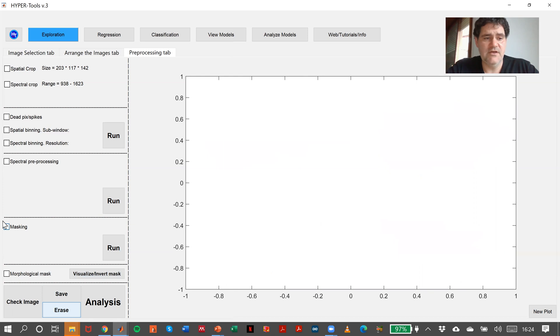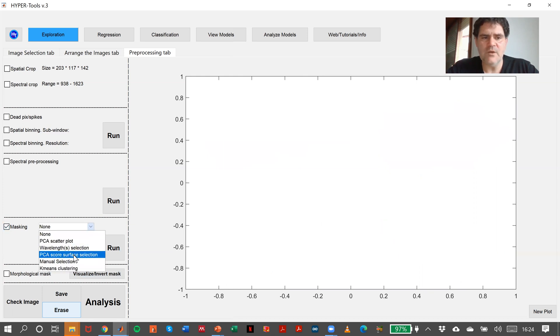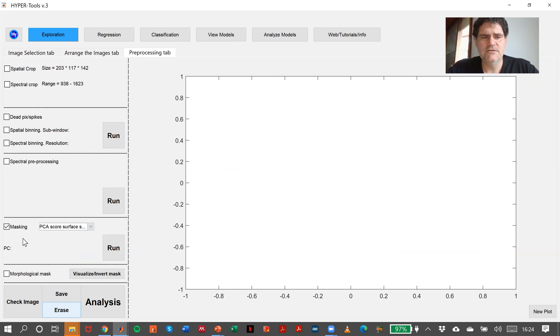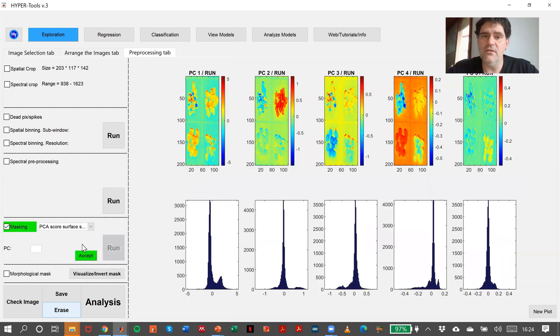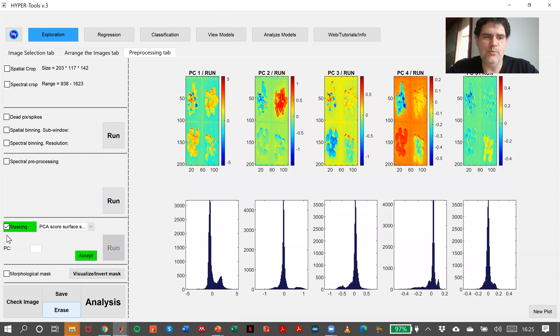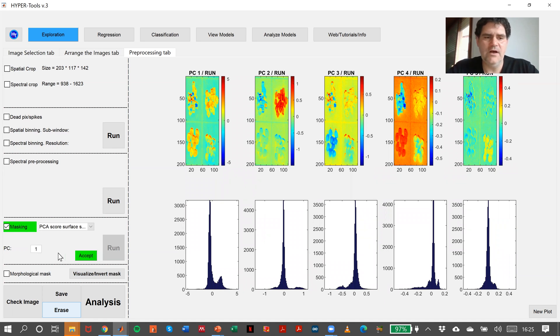There is another method called PCA score surface selection. I run it, it will calculate the PCA model, and we have to select one of the principal components. So, for instance, component number one, accept.